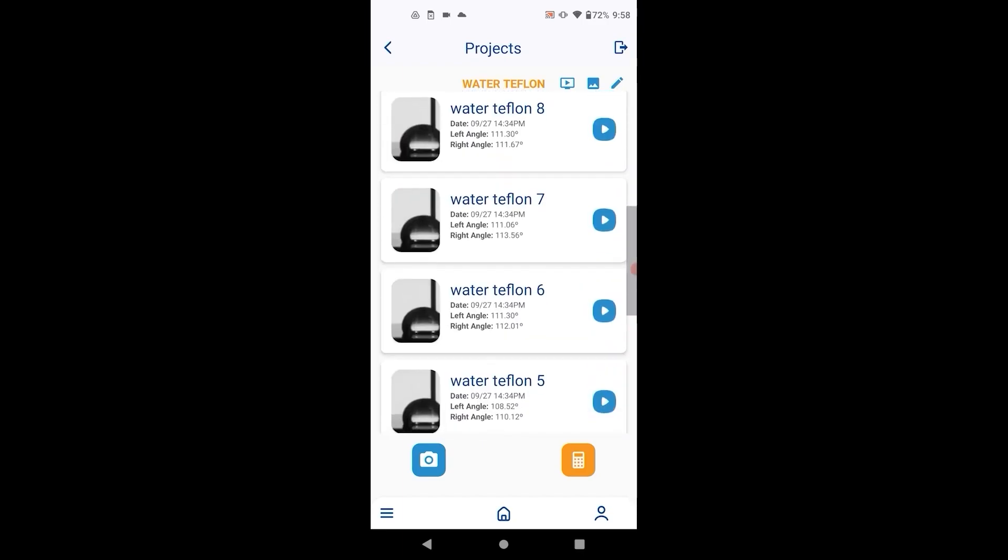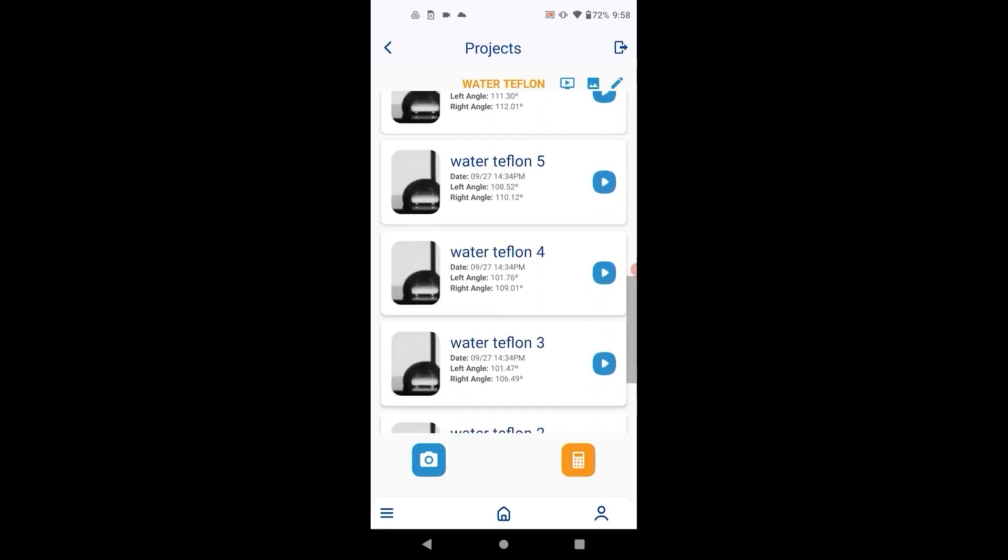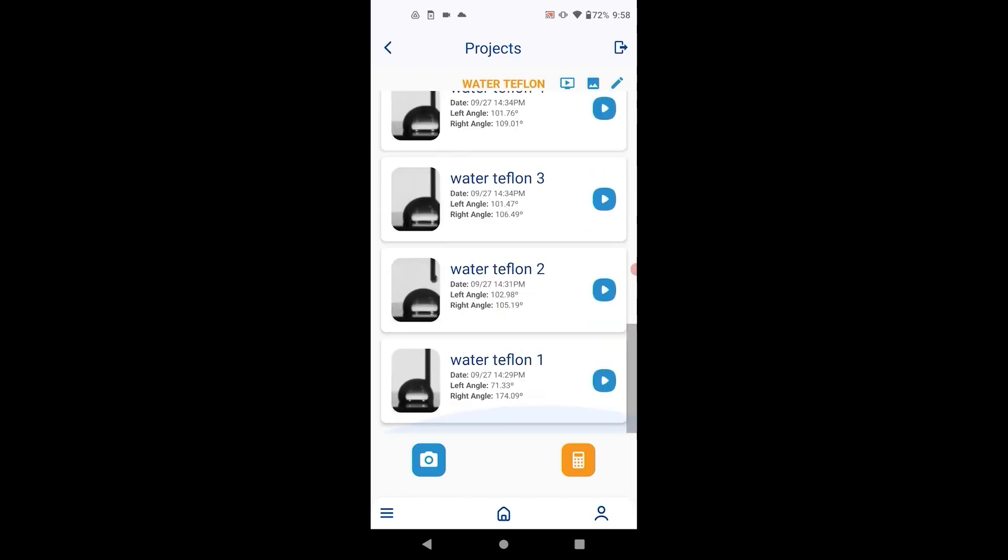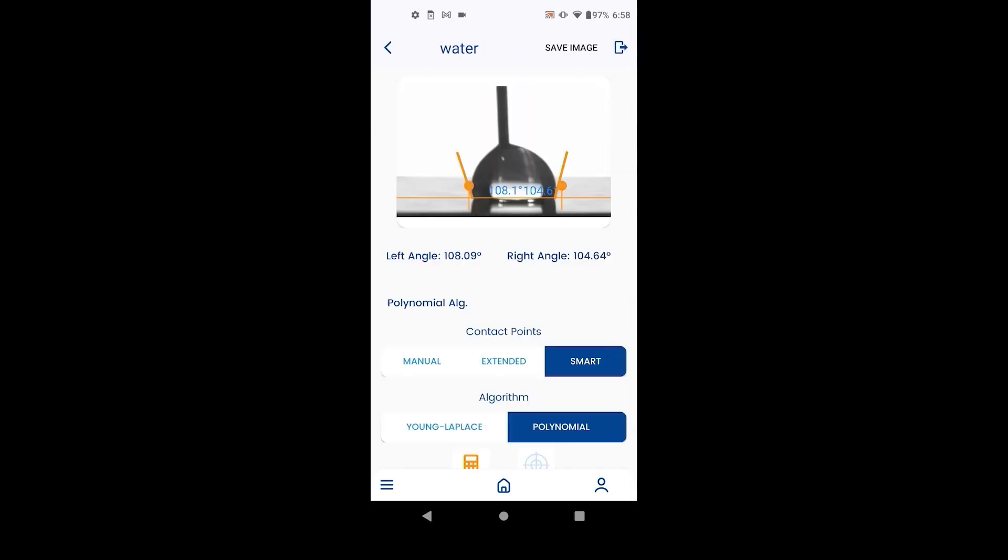After completing a calculation in a series of images, the rest of the images can be automatically calculated from the project screen if all the settings were the same for each image.